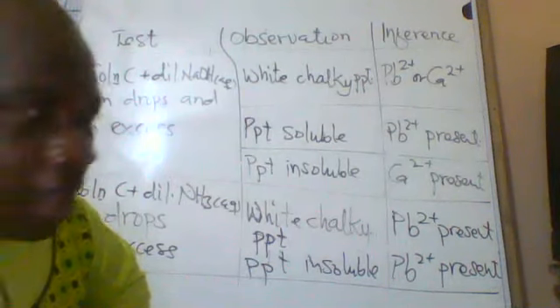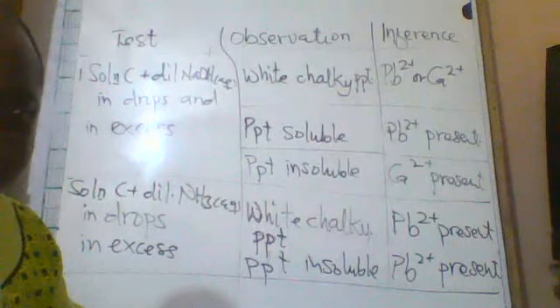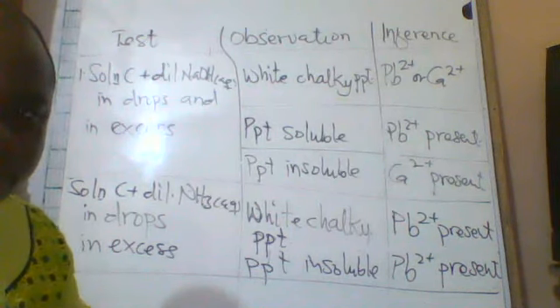In the case of zinc and aluminum, we needed both of them to get to the end of the reaction. It doesn't occur here. Do you get what I'm trying to say?